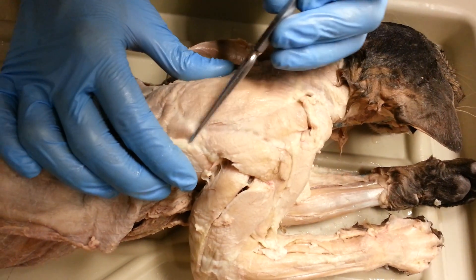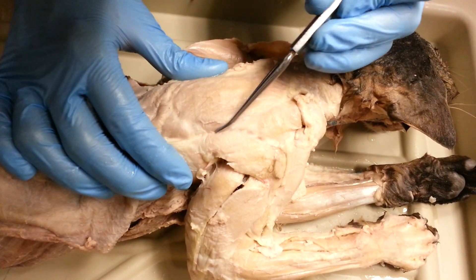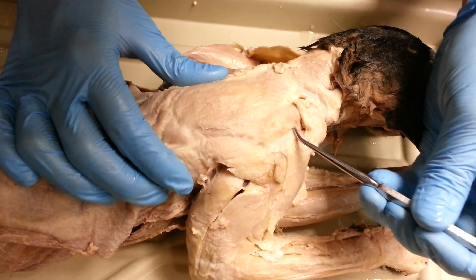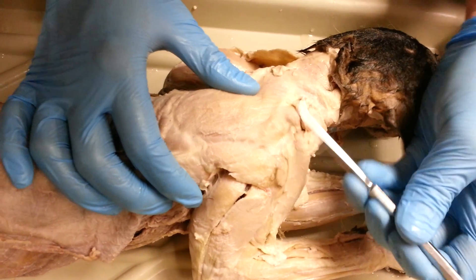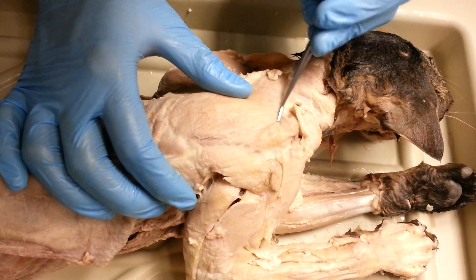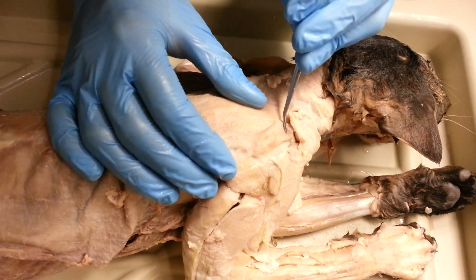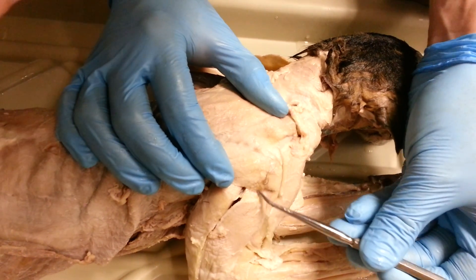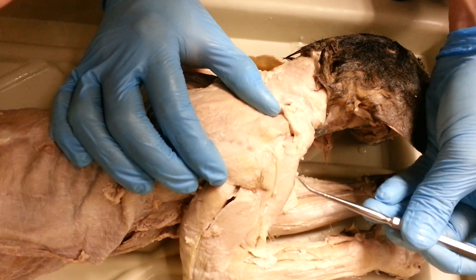And then down, we have to do the deltoids. The spinodeltoid is this circular one right here. Then we have levator scapulae ventralis, which is this one right here — it hasn't been very well taken out, but it would be this one right here. Then we have acromiodeltoid, which is this one right here, and clavodeltoid, which is this one right here.